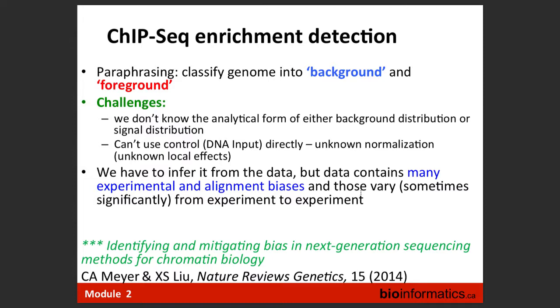Although presumably the true background is very, very unspecific. Still remember that in our IP, there are still reads which were pulled out with the antibody. They are likely non-specific, but they still function as part of the pulldown. In our DNA input, we didn't have this step. So we also don't know what is the fraction of background in the IP.